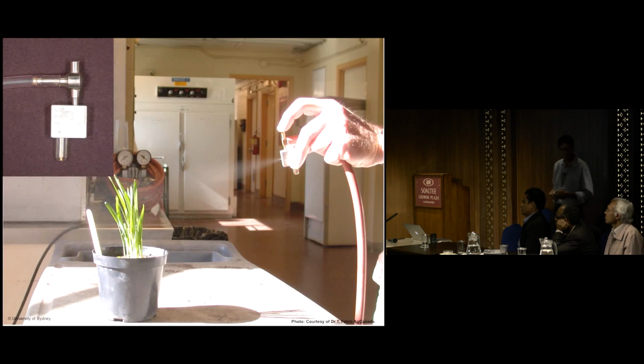Okay, so these are some pictures from Dr. Fetch in Canada. This is a system that he uses. Eugene uses this. Zach uses it. I've been trying to get my group in Sydney to adopt this for about the last 10 years. I keep telling them we've got to get these things and use them because they really are good. They cost a bit of money. You've got to go to a place where these things can be made, but they have a gelatin capsule that Zach talks about where you have your rust and your inoculum.